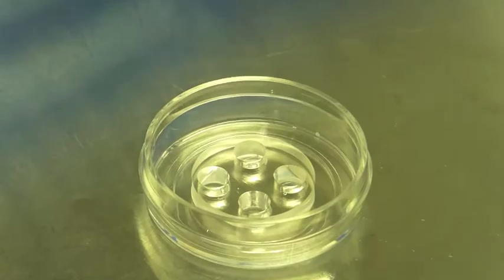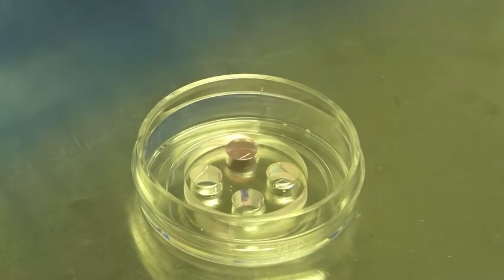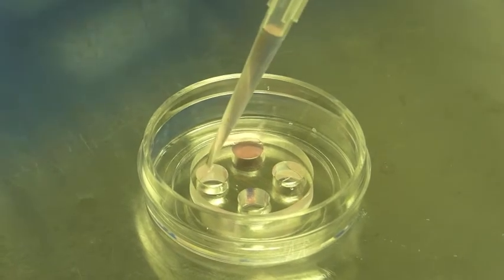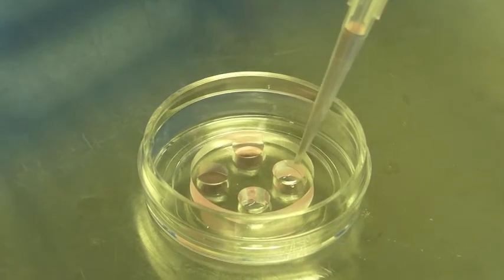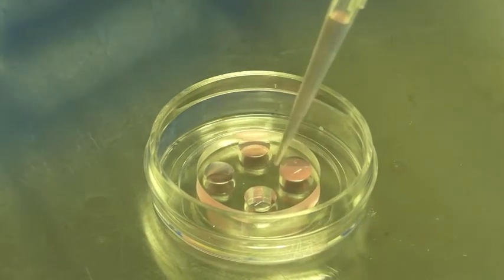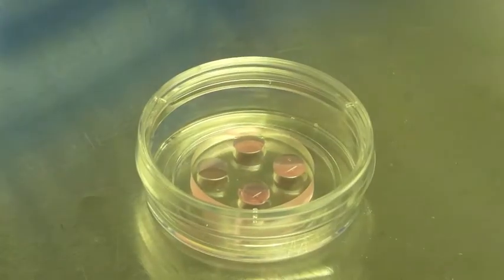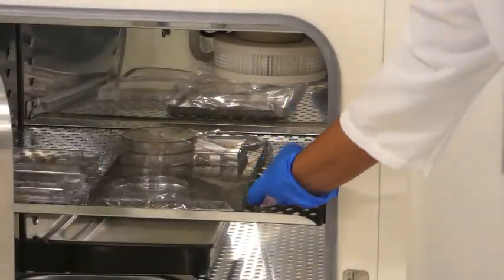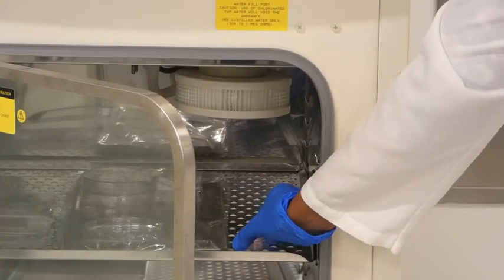After waiting 5 minutes for the cells to attach, add approximately 100 microliters of neuronal culture media to each of the top right and left wells. Then add 100 microliters of media to each of the bottom right and left wells. Cover the dish and place it into a 5% CO2, 37°C incubator.